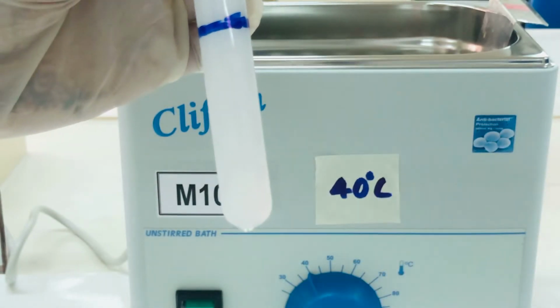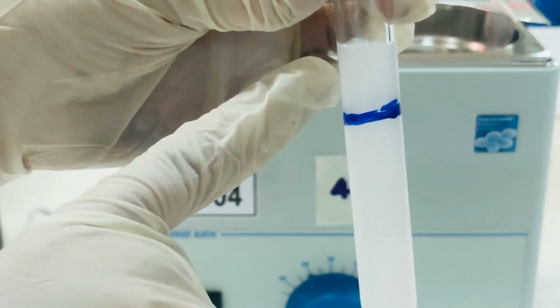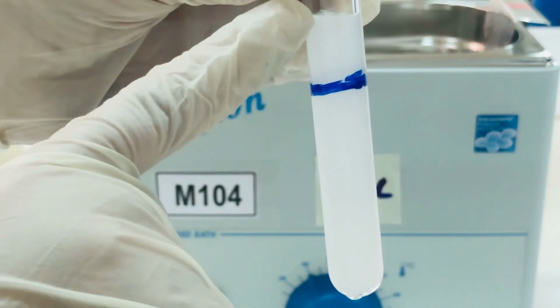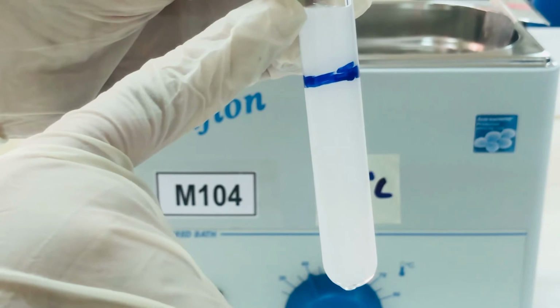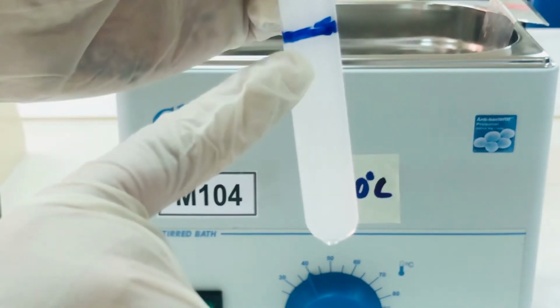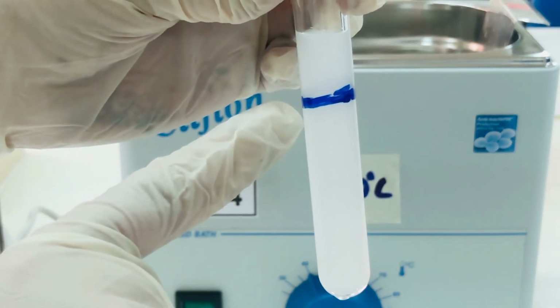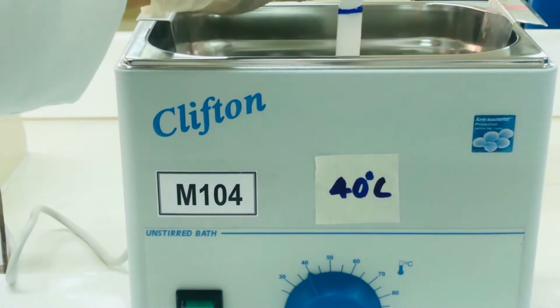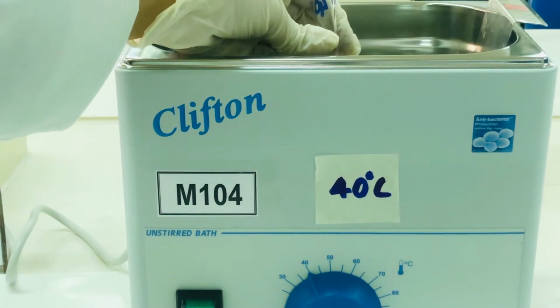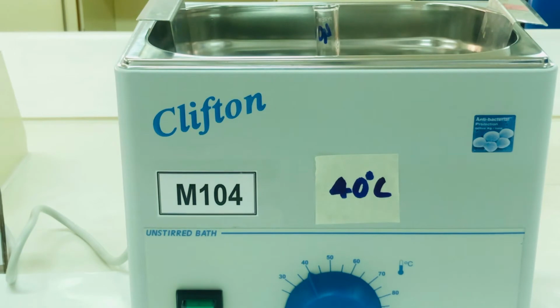What we have to note down is when the curdling of milk will take place, the solids will start settling down, and when it reaches this mark, we have to record the time taken. We will replace the mixed sample back in the water bath.